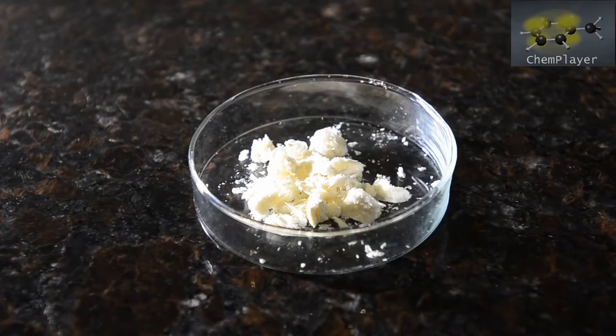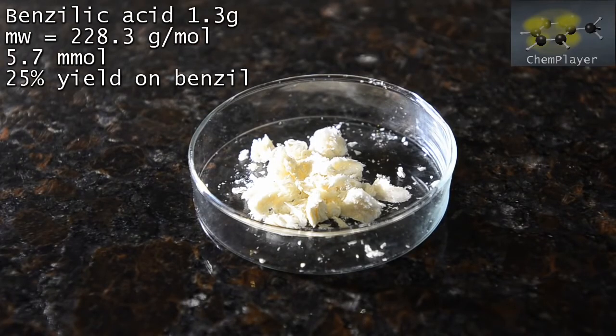And here we go. Our final product. Benzilic acid as silvery flaky crystals. It looks a little bit like phenylacetic acid, only it has a very slightly faintly sweet sugar aroma.